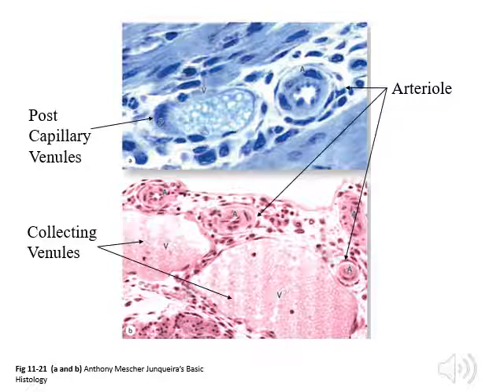The lower portion of the photo is depicting the larger collecting venules, and again you can appreciate their very simplistic wall with only occasional smooth muscle cells within their tunica media. In fact, the smooth muscle cells can often be quite difficult to appreciate. It's really the marked lumen size, again, that sets these venules apart from the arterial system. If we were to look at an artery as large as this particular venule depicted in the picture, it would have quite a prominent and obvious tunica media.